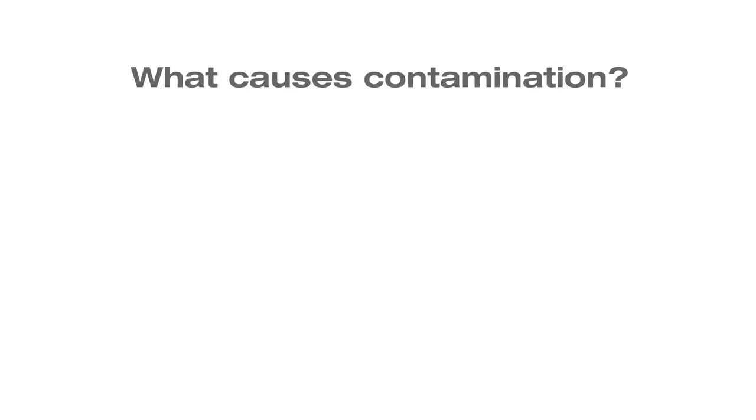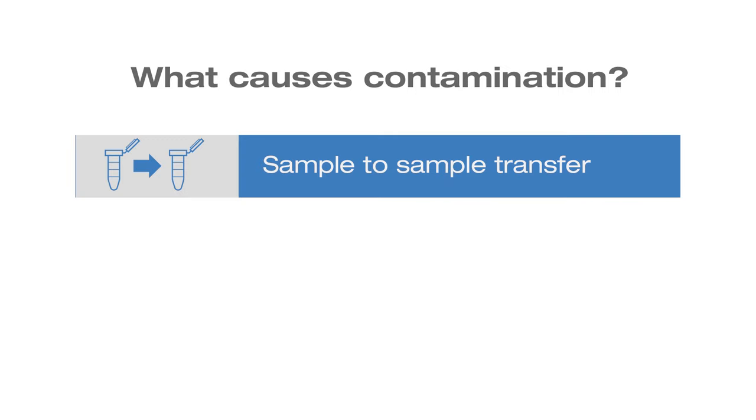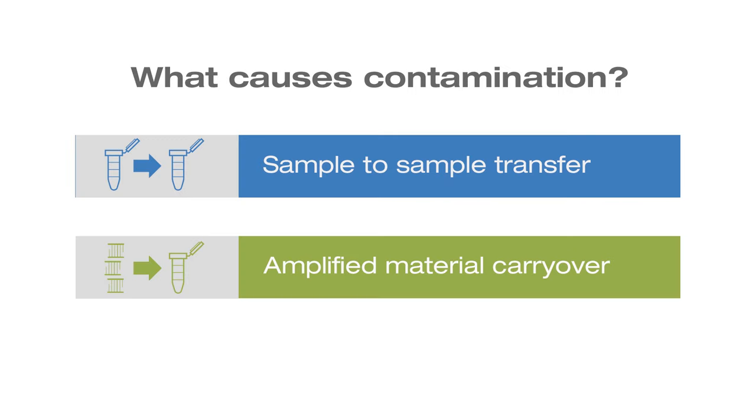Contamination can arise from simply transferring a small amount of one sample into another, or it can be traced to previously amplified material making its way into the next batch of samples to be amplified. In either case, contamination can have a major impact on the project data.